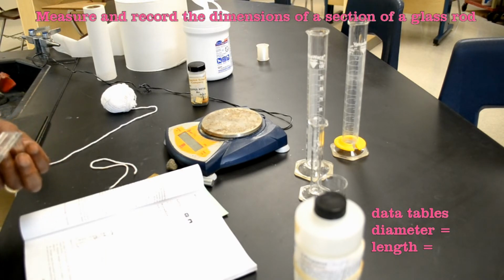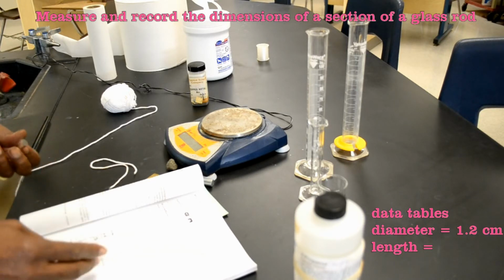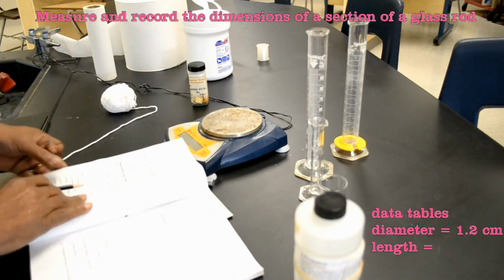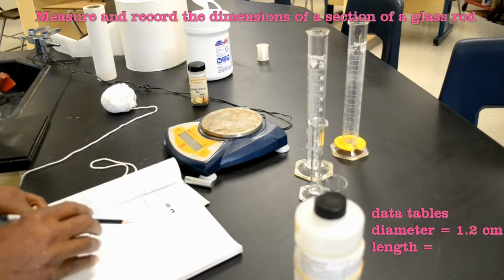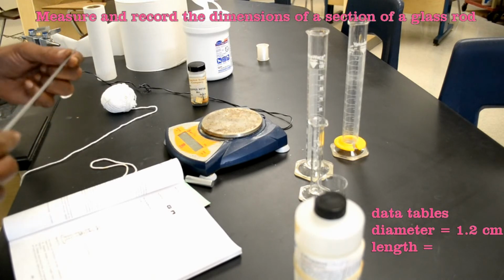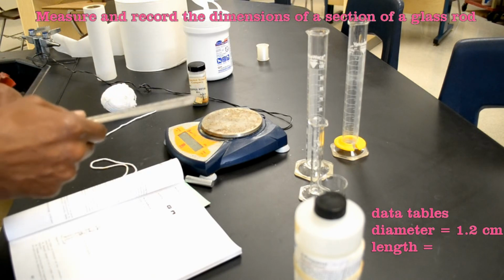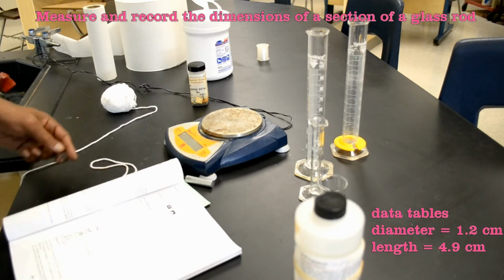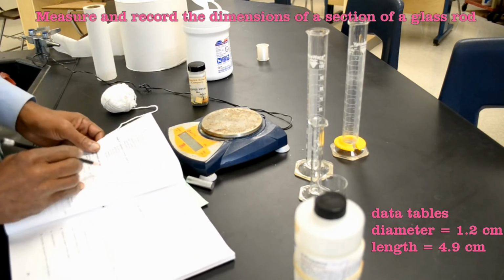The diameter is 1.2 centimeters, so I'm going to record that here, 1.2 centimeters. The length of it is 4.9 centimeters.